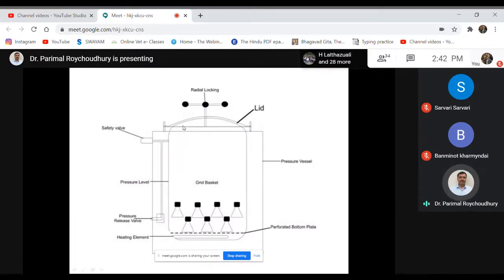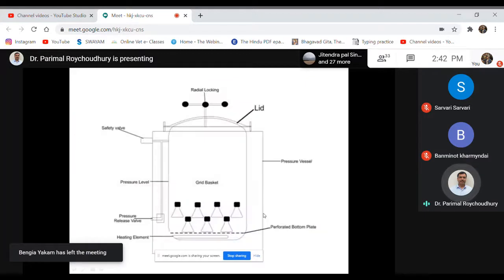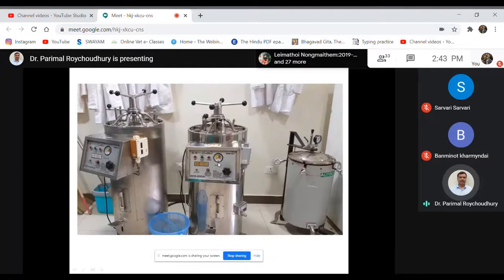So we have to close the lid very tightly. And once the steam rises, it cannot escape. So the steam goes on accumulating, the pressure inside will increase. Once the pressure increases, temperature will also increase. Got it? So when the pressure reaches around 15-pound pressure, which is indicated by this pressure knob here, these are pressure indicators. When it reaches 15-pound pressure, then we start counting the time, for 15 minutes.